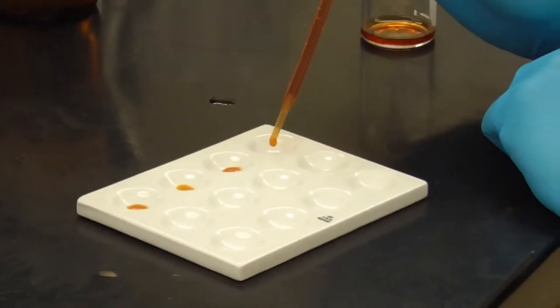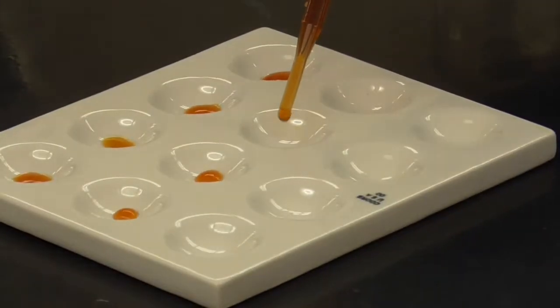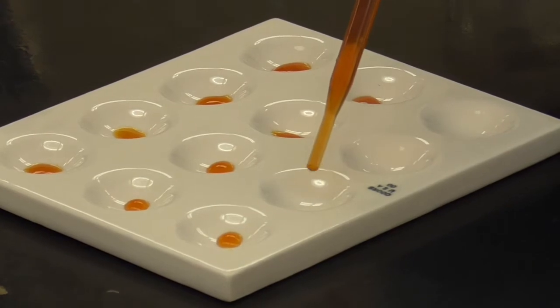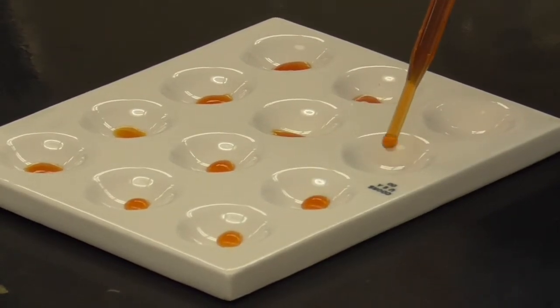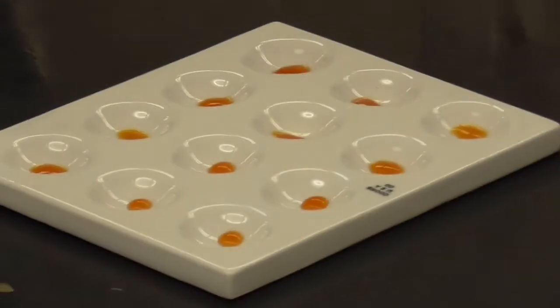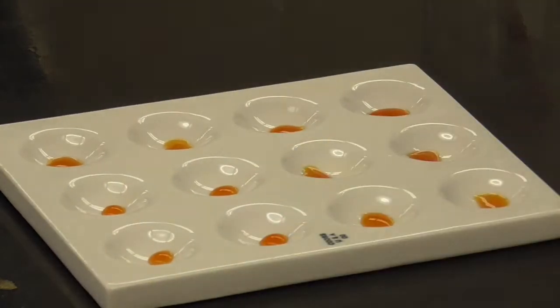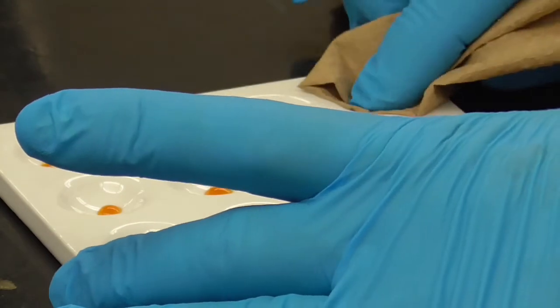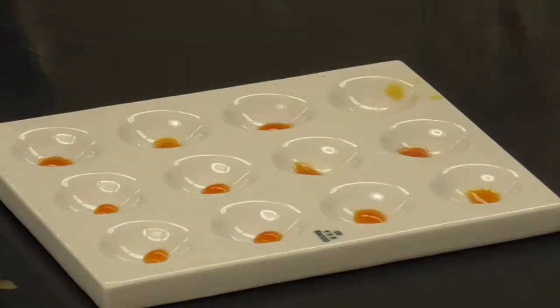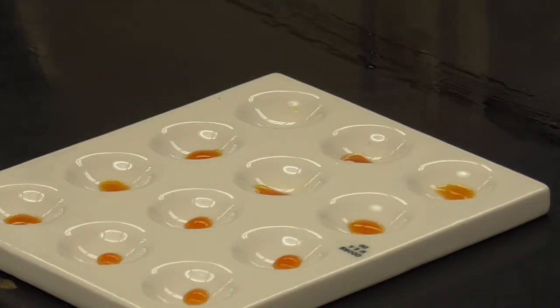And again, there's the natural color of the iodine solution. I actually got 2 drops, I think, in that last one. I might go back and redo that one. The drops are clearly not highly reproducible. They're about the same size in each one. Not bad, but I think this very last one I'm just going to wipe it out with paper towel and redo that one, because I'm quite positive I got 2 drops in this top one right here. I want a reasonably the same amount in each well. That one was notably higher.